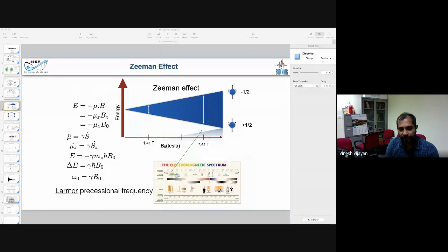I probably answered the same thing. No, you were talking about proton NMR. What are the significant others? There are these. Mainly, for organic molecules, besides proton, one measures 31P and fluorine, if the molecule has fluorine and 31P. And normally one does not measure 15N unless it's biological NMR or you enrich the nitrogen with 15N.